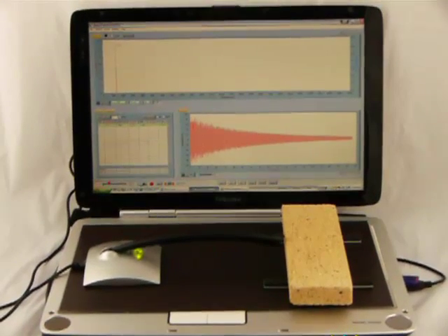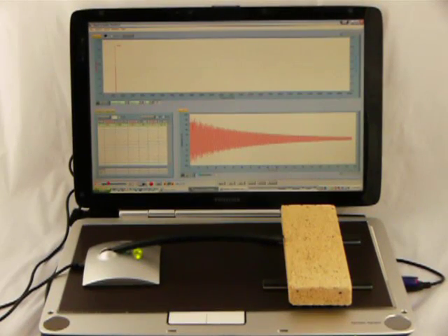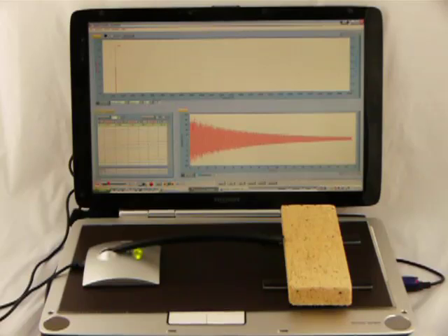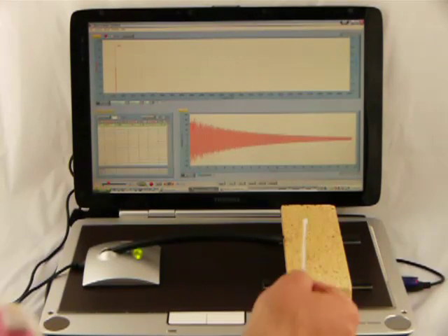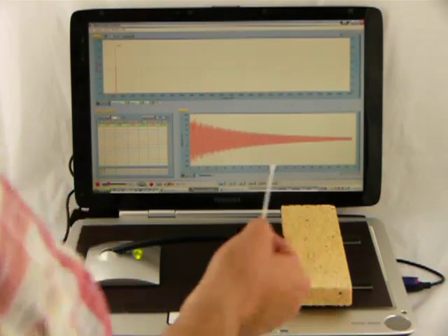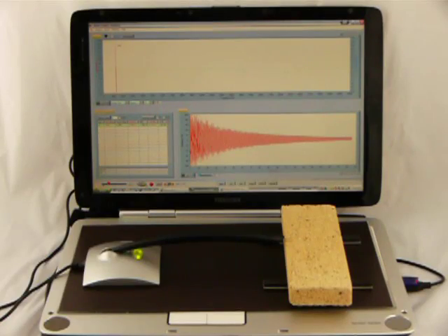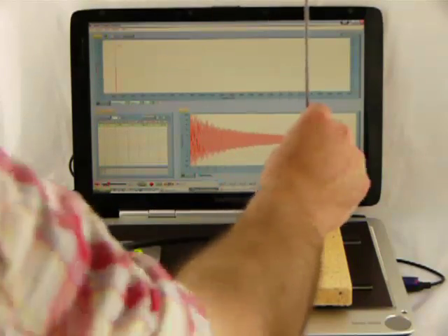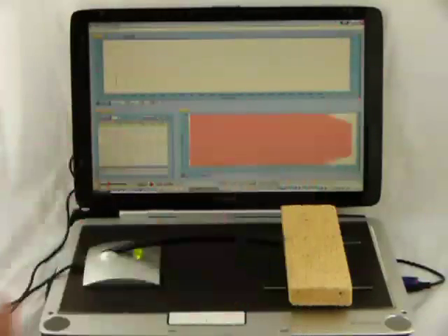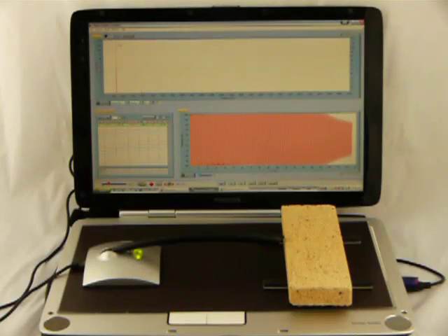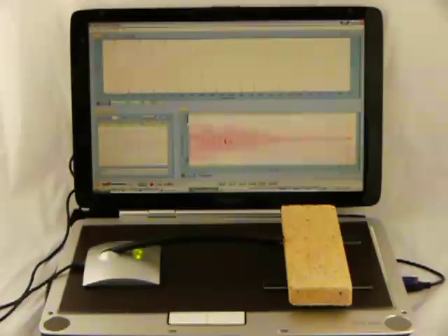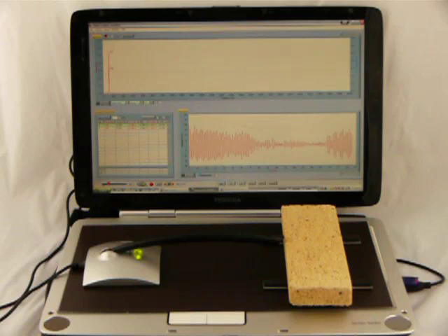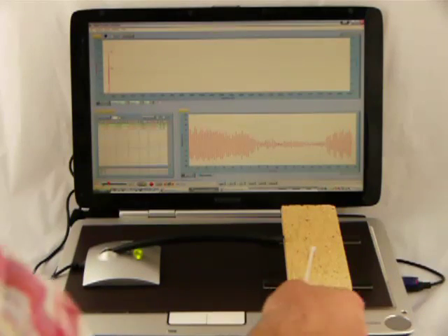As you may recall, we can also tap the material in the center. So let's do that. I get the same result. And of course I can use the mic at the screwdriver and I get the same number, but now that waveform was too high.